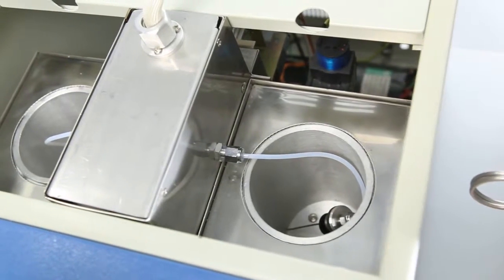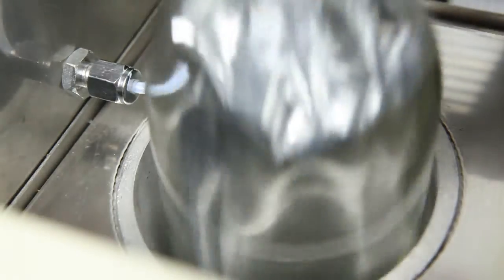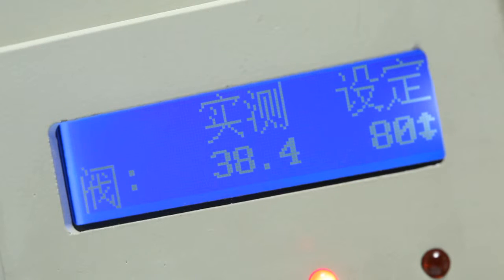The specially designed thermostatic chamber guarantees uniform temperature distribution around the headspace bottle. It utilizes a high precision temperature control algorithm that can achieve an ultra-wide range of temperature control.